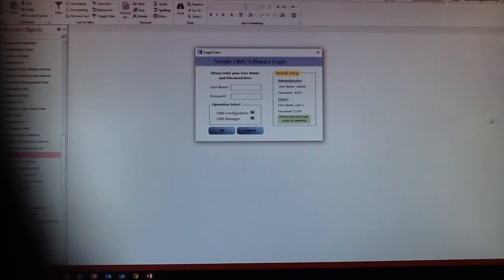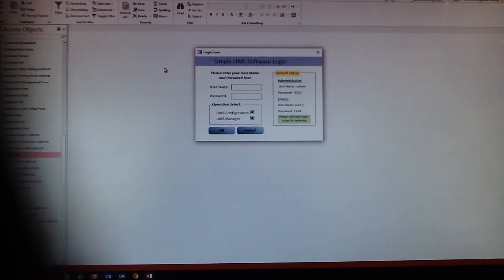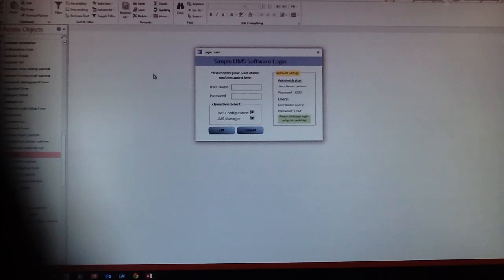Hello everybody, welcome to SimpleLim Software's demo. First of all, when you start SimpleLim Software, which is a Microsoft Access-based LIMS software, the first thing you will see is SimpleLim's login page.